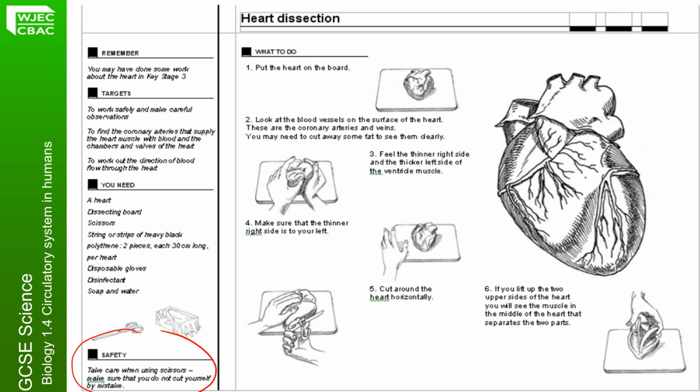And you can get your hearts from Tesco's, Morrison's, I'm sure there are other good retailers, or even a butcher if you've got a local butcher. If you have a butcher, he may very well leave on for you these blood vessels that we can see on the top of this diagram of this heart, and I'll show you photos of real hearts so you can see them a little bit easier in those.